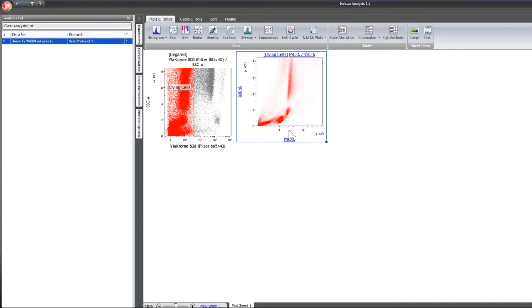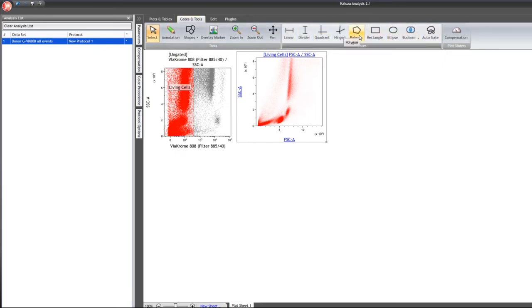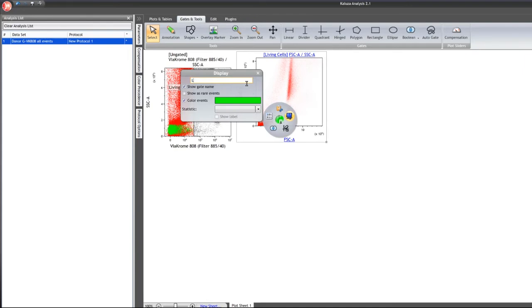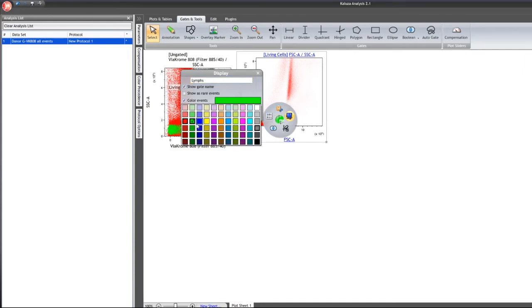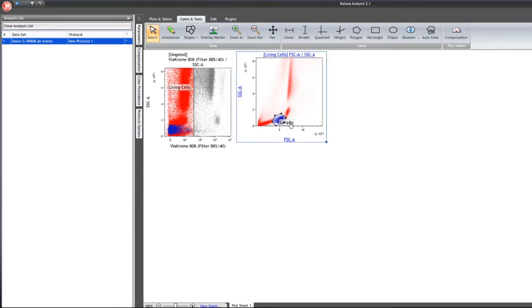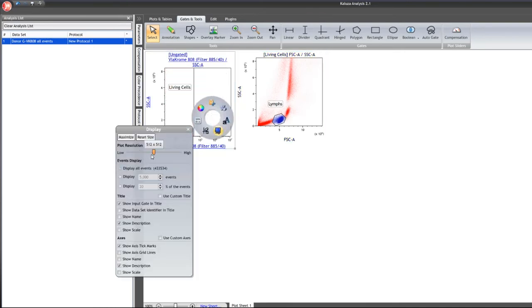You can adjust the resolution as much as you want to display the data the way you prefer. Clusa also has unlimited undo and redo if you need to revert any changes. To gate this population, go back to gates and tools and choose a polygon gate. Each click within the plot creates a vertex for the polygon gate; double-click to close the gate. Right-click the gate to give it a name and change the color. You can move the gate label anywhere on the plot, and after the gate is created you can still adjust the resolution slider for display purposes.